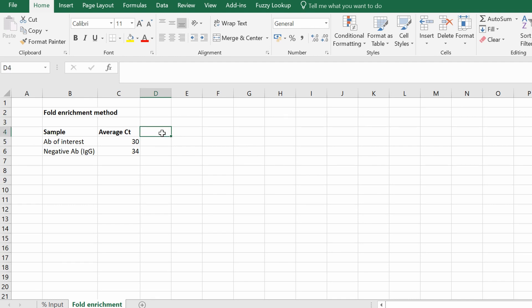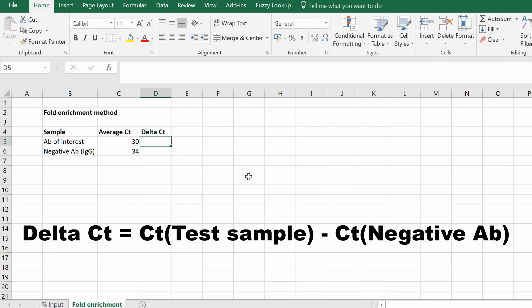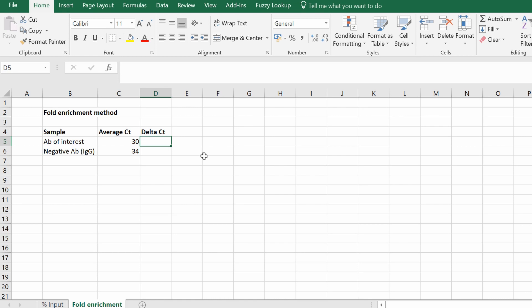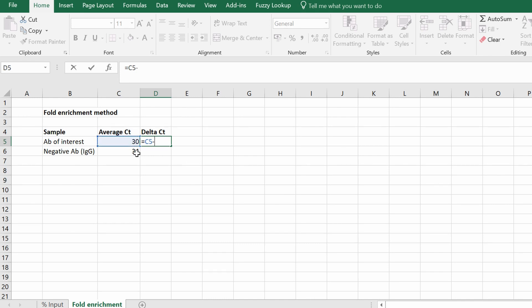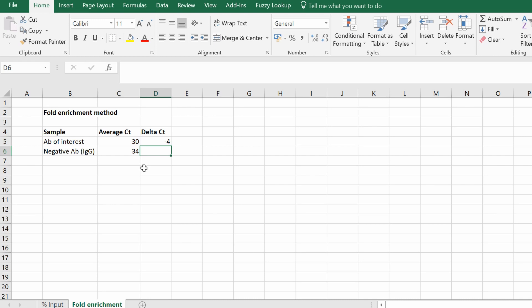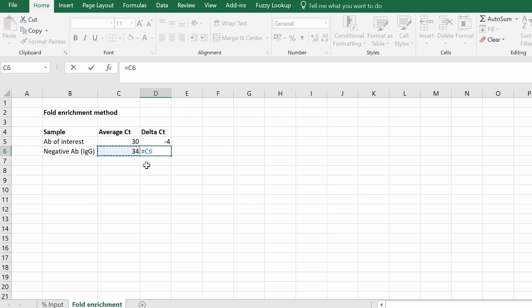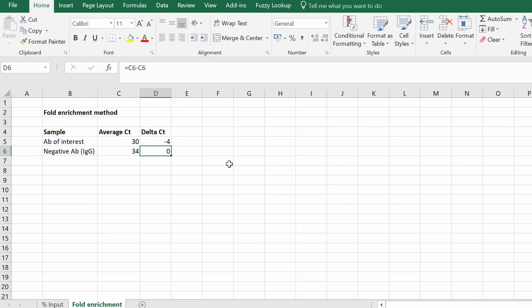The first thing to calculate is delta CT. Delta CT in this instance is the difference in CT value between the antibody of interest — or any sample you're interested in — minus the CT value of the negative antibody, which serves as the background signal. For the antibody of interest, type equals the CT value for the antibody of interest minus the CT value of the negative antibody, then press return. For the negative antibody, it's equals the negative antibody CT value minus the negative antibody CT value, so the delta CT should always equal zero.